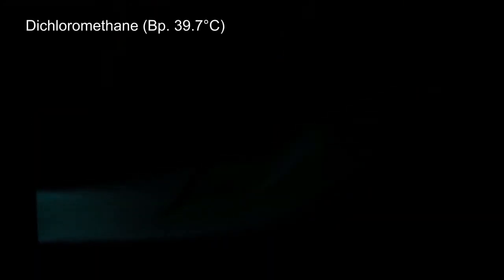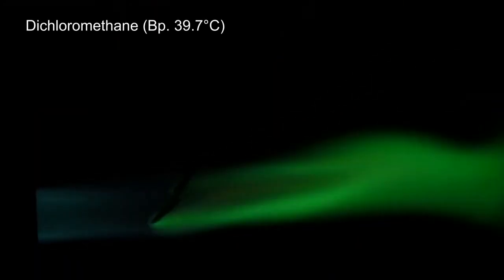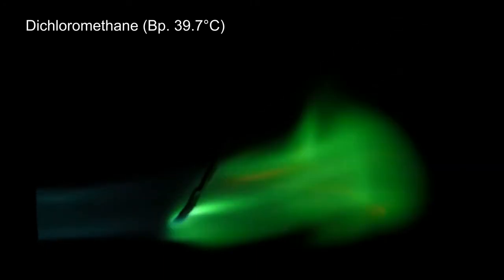At the end, I was curious if a highly volatile compound could even be tested, so dichloromethane with a boiling point of 39.7 degrees C was used.